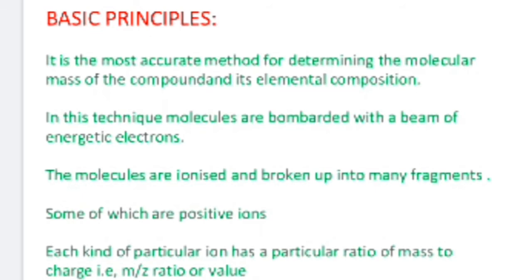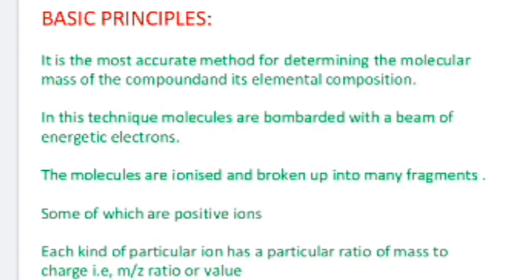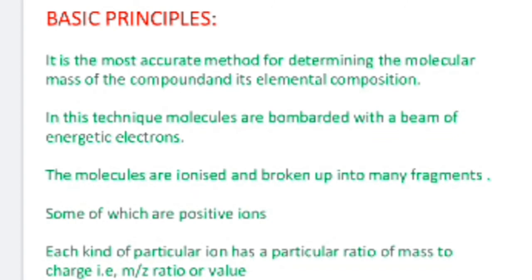The molecules are ionized and broken up into many fragments. This is the main principle of mass spectrometry.